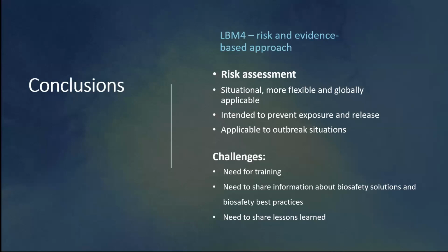Challenges, there are several challenges. There is need for training, not only in biological risk assessment, but also just in biosafety practices in general. There's a great need to share information about biosafety solutions and best practices, and also a huge need to share lessons learned so people don't repeat each other's mistakes.